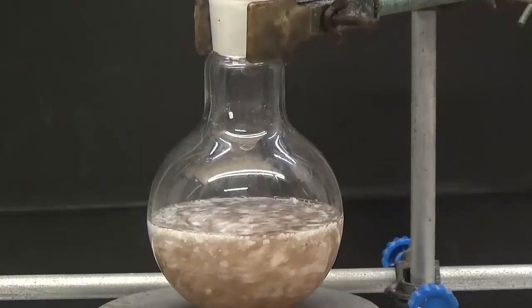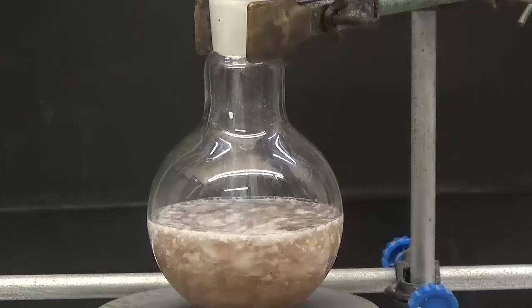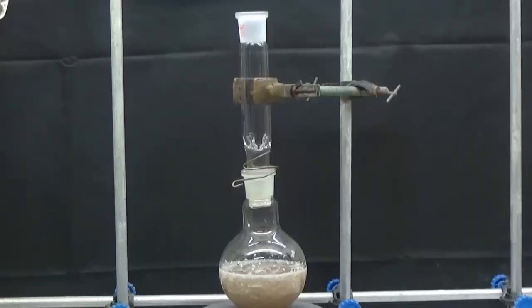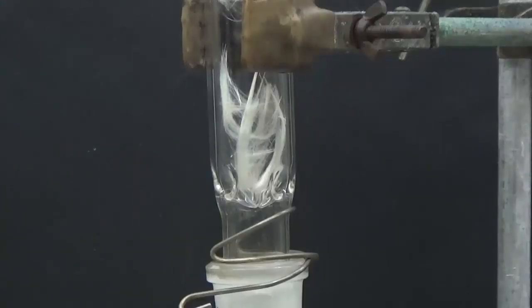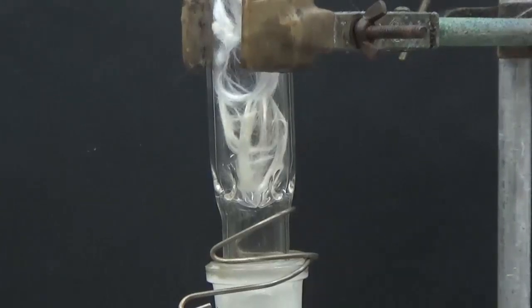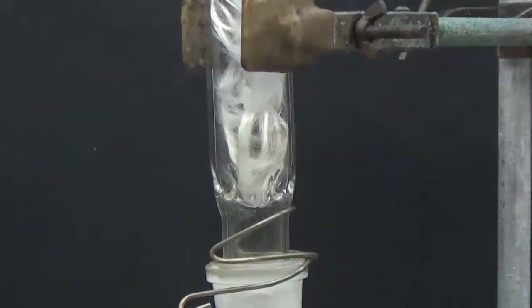Stir for approximately 20 minutes. Assemble a column packed with fiberglass in the flask to retain the phthalic anhydride that can sublimate.